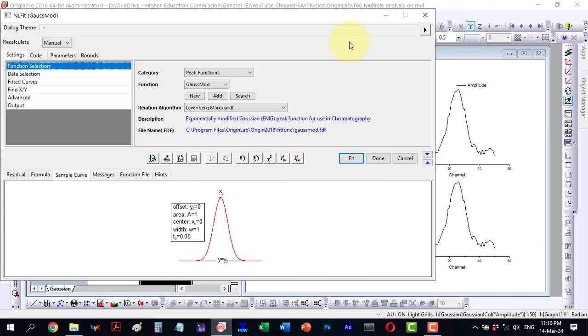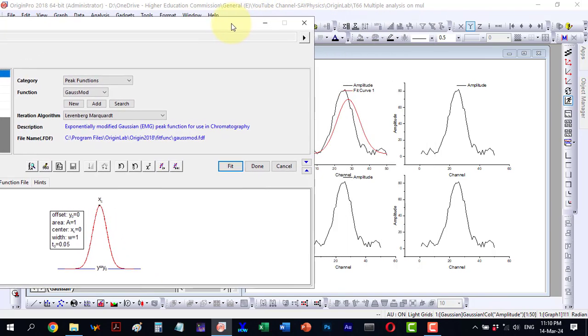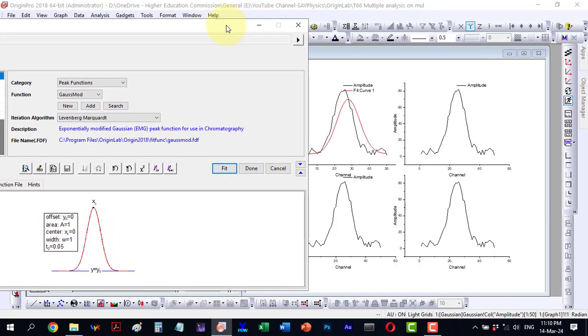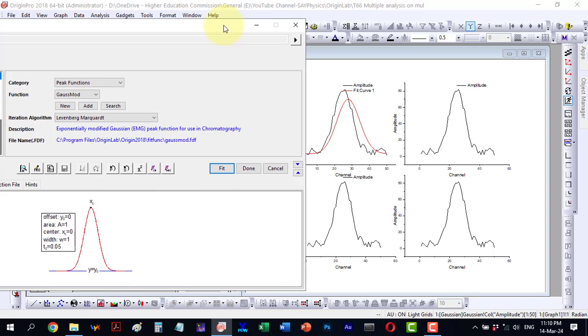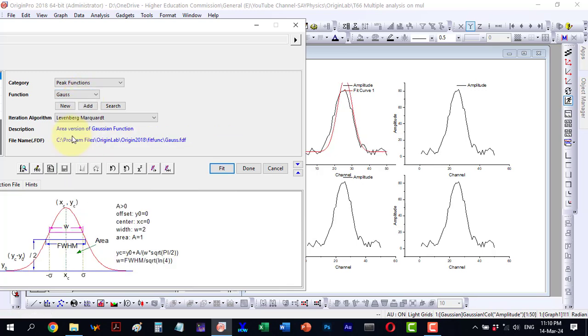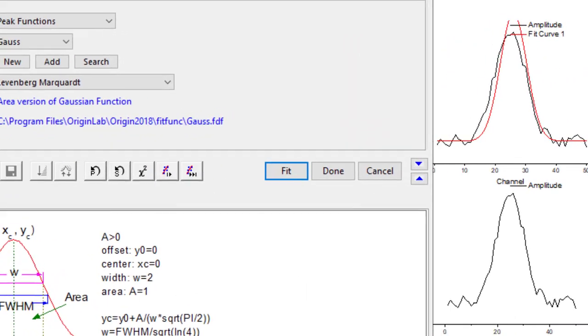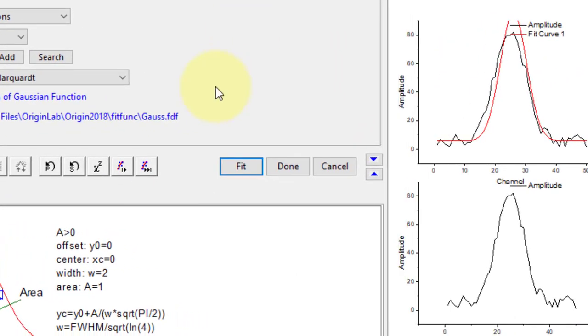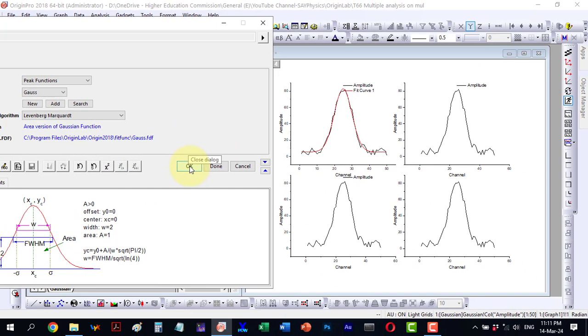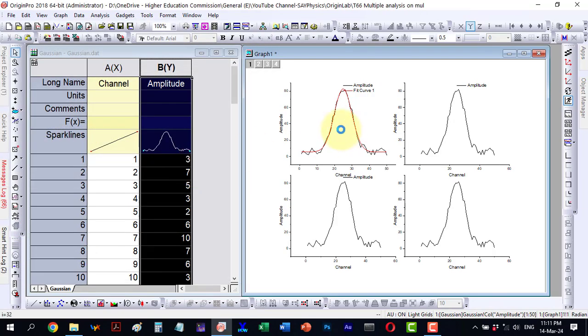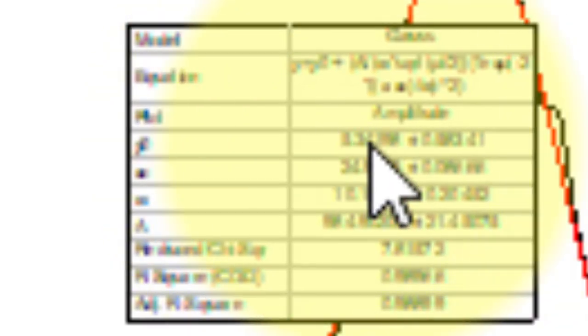Since I have selected this data, I will commence with this function first. I proceed to fit and as the fitting improves, I continue in this manner. Eventually, it reaches the best fit. Clicking OK.